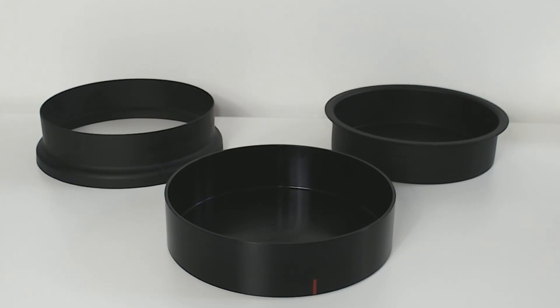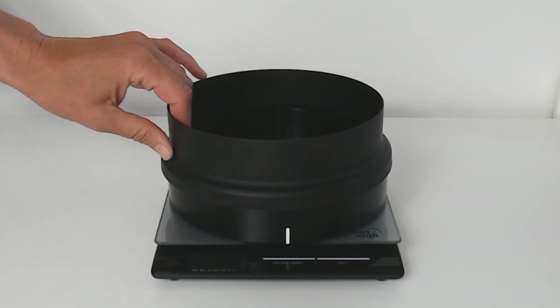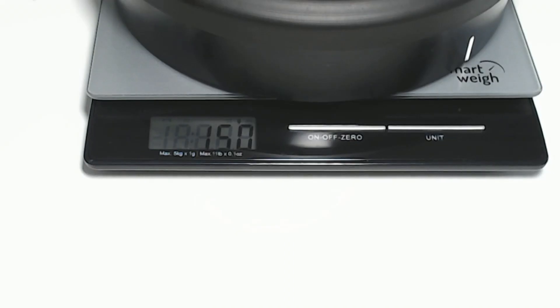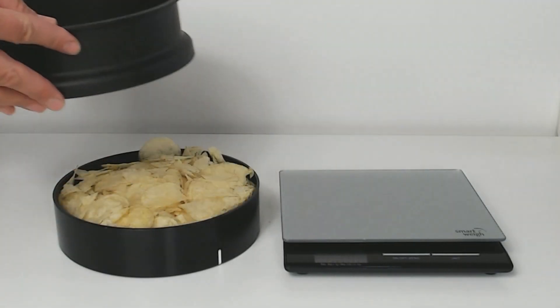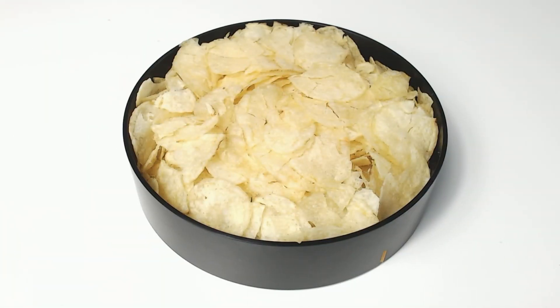First, use the Eros Crush Pan accessory to evenly flatten the sample surface. Assemble the sample pan and retaining ring in the manner shown. Pour 150 grams of sample into the pan. Press the flattening unit down into the sample pan until they touch. Remove both the flattening unit and the retaining ring. Now you have a uniformly even sample surface for measurement.